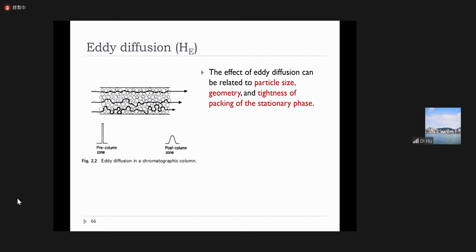Because we're talking about HPLC, the LC column is a packed column. What does that mean, packed column? It means inside the column we have those particles. Remember we're talking about dp, the diameter of the packing particles. We have silica gel particles that are coated. If it's partition chromatography, it's chemically bonded with some liquid layers. So that is the stationary phase, right? And then we do the separation, with the column packed with those particles.